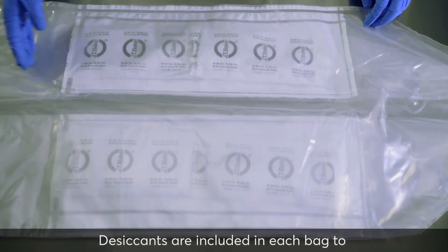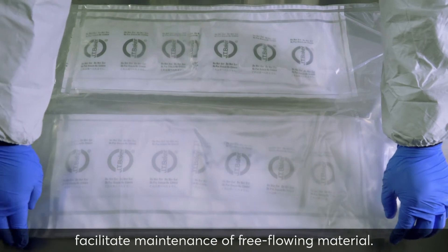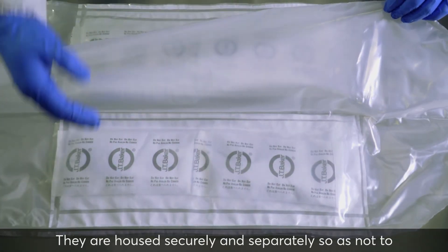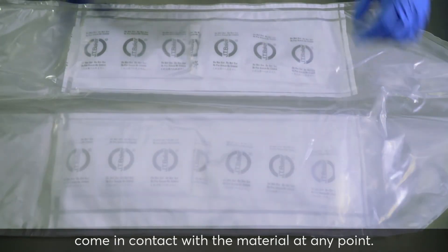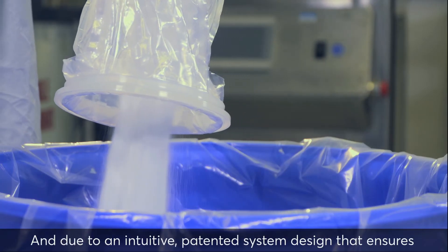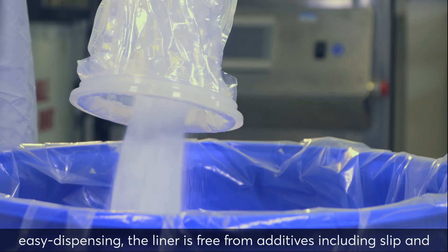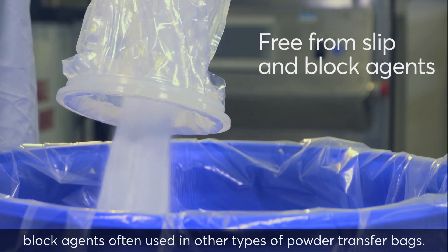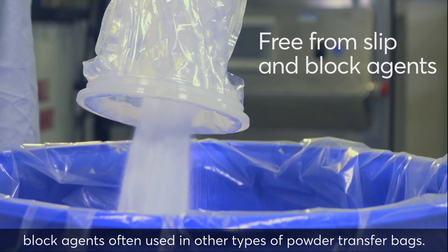Desiccants are included in each bag to facilitate maintenance of free-flowing material. They are housed securely and separately so as not to come in contact with the material at any point. Due to an intuitive, patented system design that ensures easy dispensing, the liner is free from additives, including slip and block agents often used in other types of powder transfer bags.